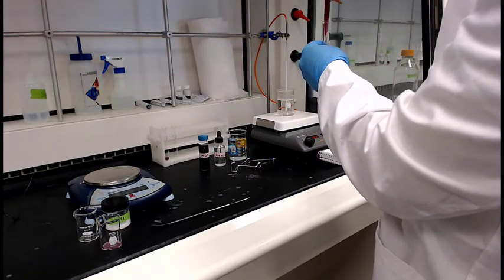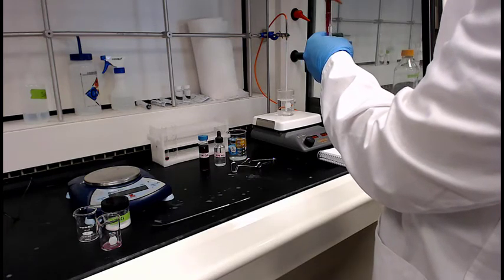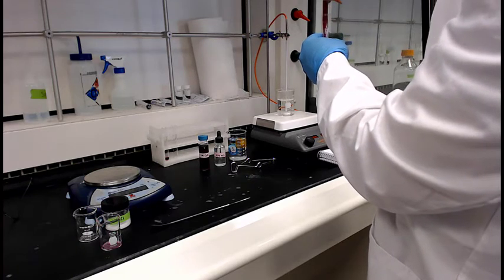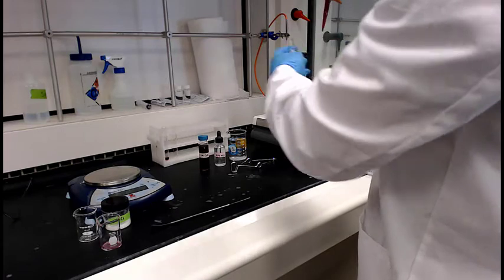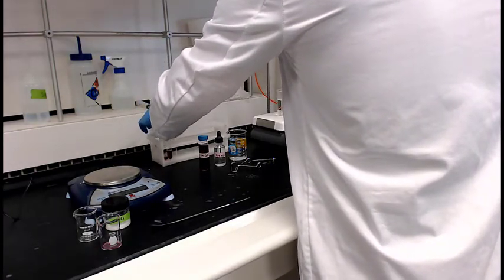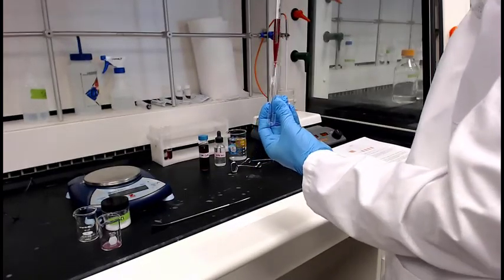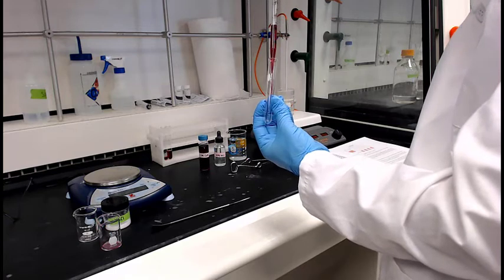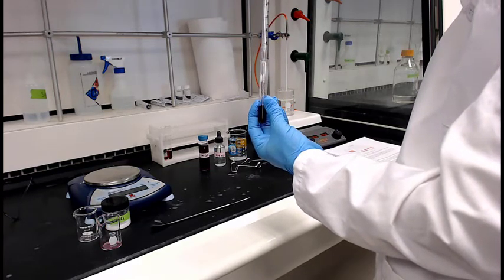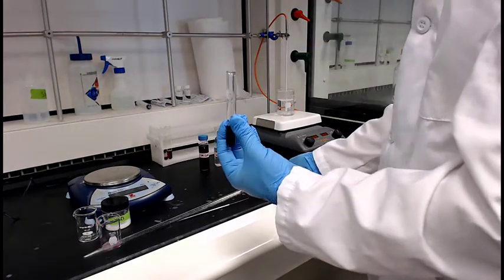Still working on step 3. Remainder goes in tube 3, roughly 2.5 mils. Or he should, if he pulled all the way up to 5, he should be able to just drop all the rest of that in there, and that should be right. All right. Good job.